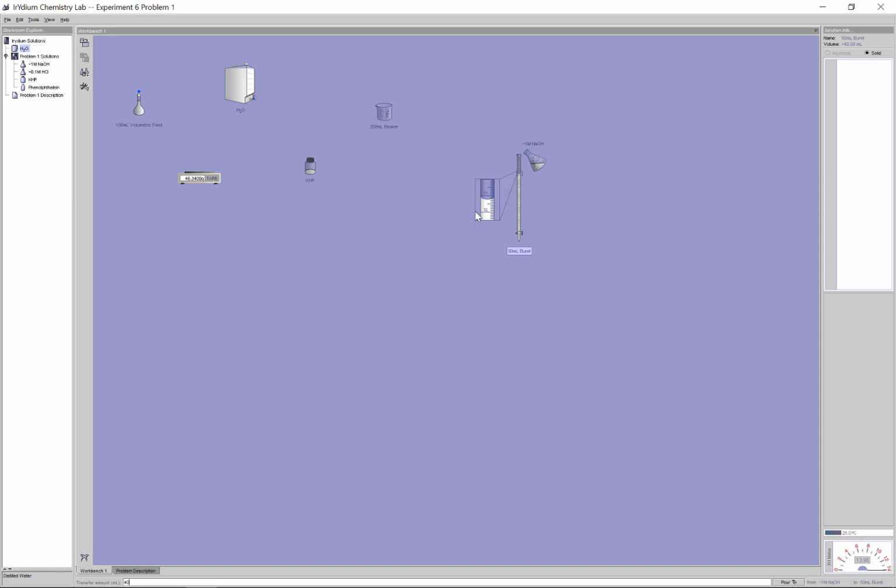The 11 mark is on top, the 12 mark is on bottom. Burettes can be read to 2 decimal places. So I'm just going to note down this volume here, maybe 11.21 milliliters. That does not mean there's 11.21 mL of liquid in the burette. Remember, the 50 mL mark is down here. There's some 40 mL in here, but that's okay. I'm going to take a starting burette reading. When the reaction is done, I'm going to take an ending reading. I'm going to take the difference in volume to figure out how much I've actually added.